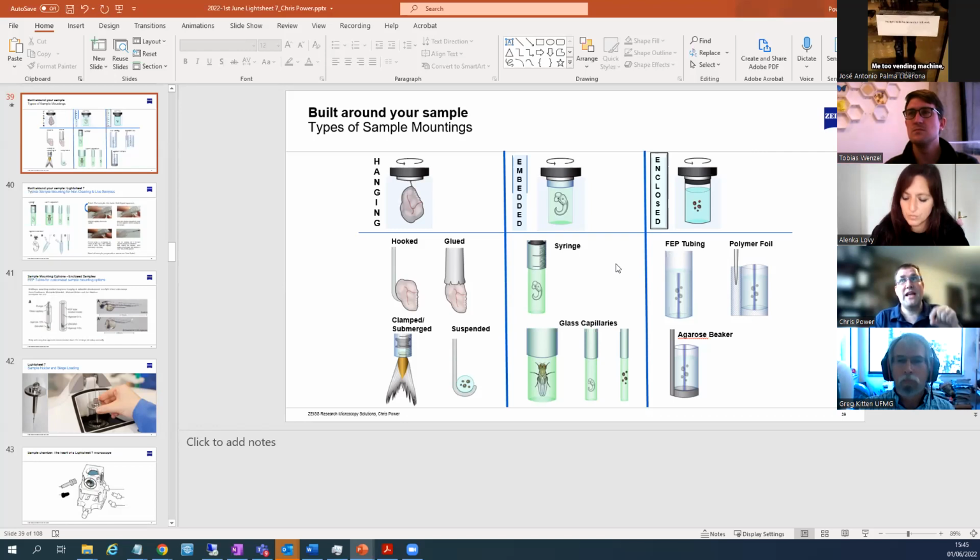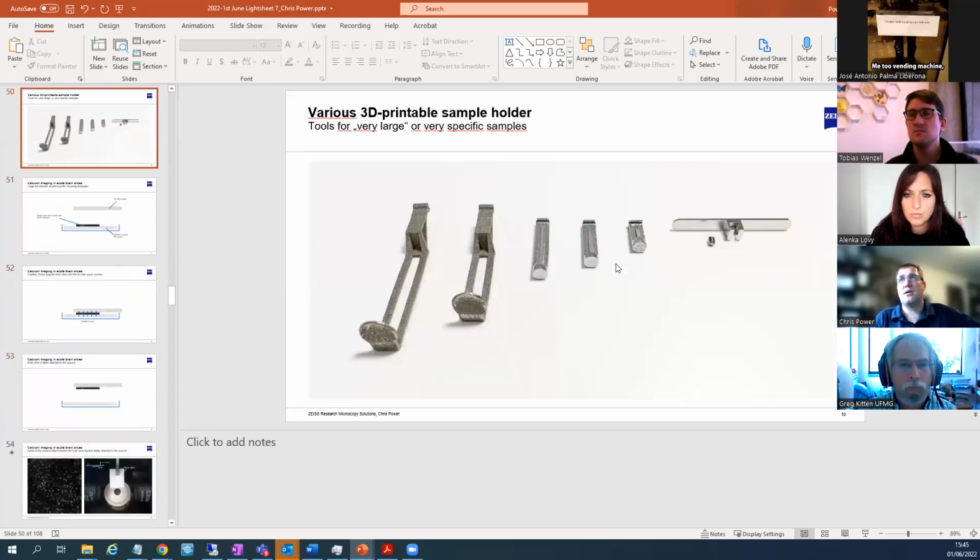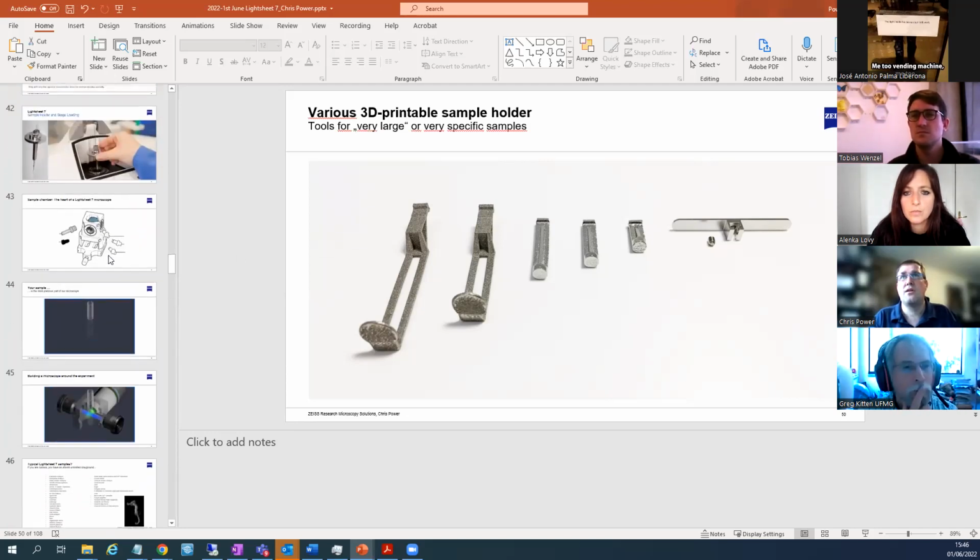When it comes to clearing, the clearing holders, we do sell some of these. So we have a few of the different brackets here, but the ones actually in the talk here are 3D printed. So we can provide the CAD design that lets you clip onto the end of the holder. And as long as you've got the right kind of connection at the end, if you have a 3D printer, it's whatever works. Usually with the clearing system, though, we tend to use a stub.